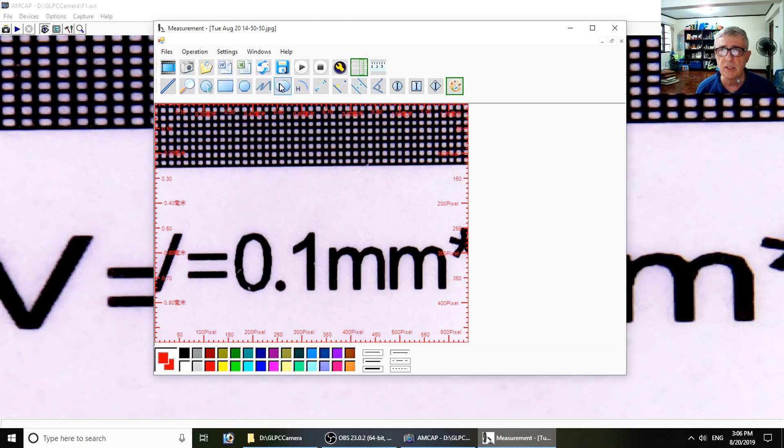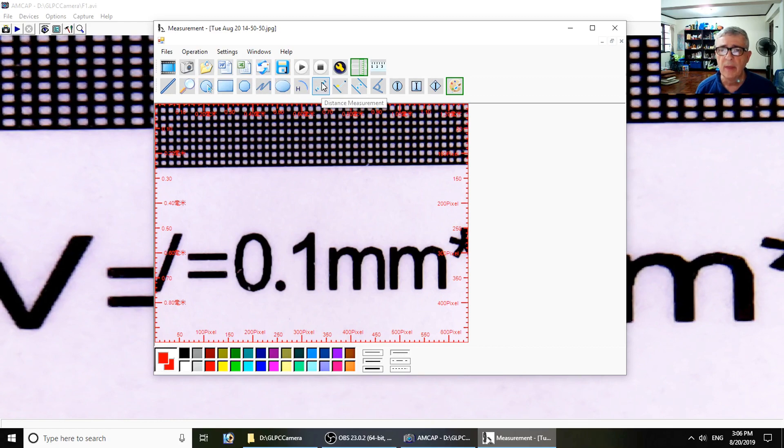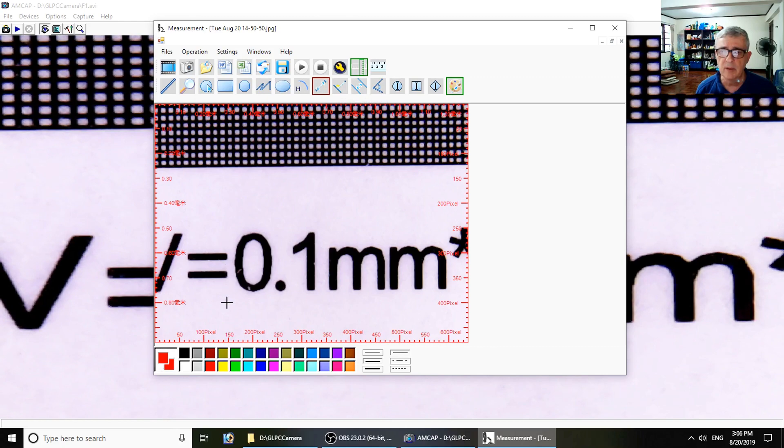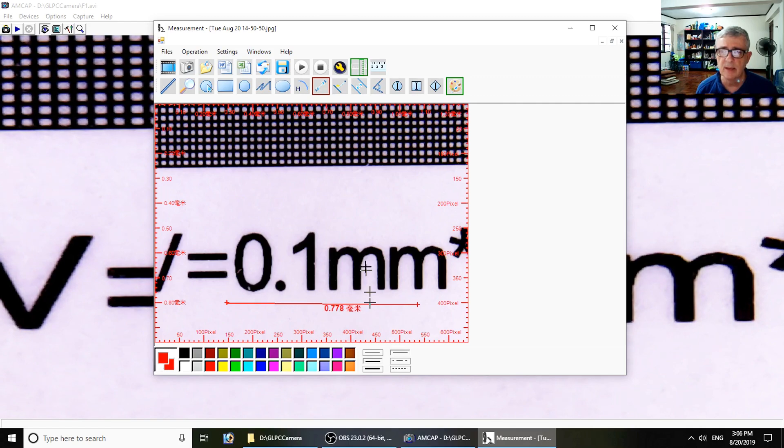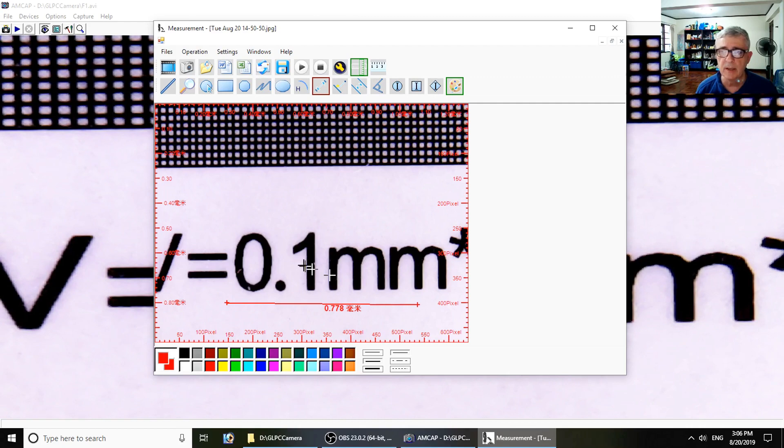These are placing shapes on the form and a curve. This is distance measurement, which is interesting. Let's see, we'll make a distance measurement from here to here, and so that's 0.778 whatever pixels.